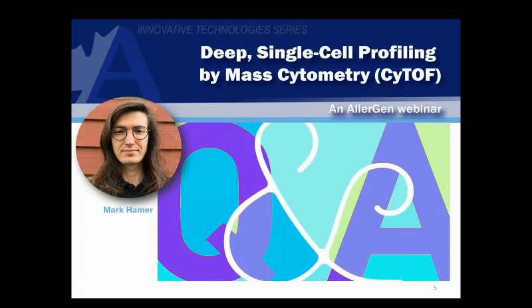I'm not going to lose that. Yeah, I think if you're using those same antibodies and you just conjugate them to metals and you design the panel around that being your top priority, you can certainly then use the available channels outside to do the more discovery-based stuff while retaining really strong, consistent data with what you see in your flow. Yeah. Okay, I would agree with that, Chris.